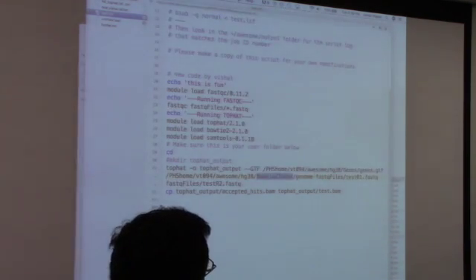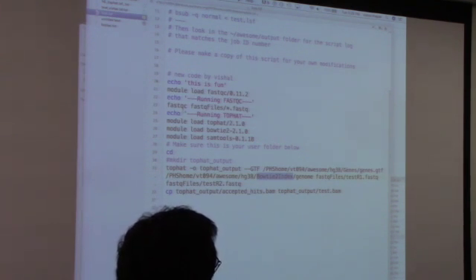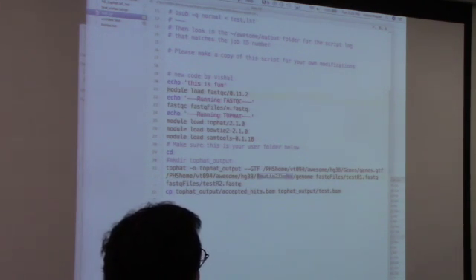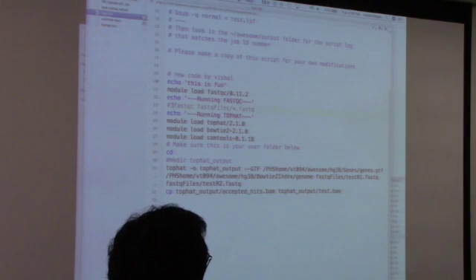Okay. So now you can run this as is, basically the exact same way you ran before. My only recommendation is that you comment out your FastQC code. Okay? Because you don't need to do FastQC again.